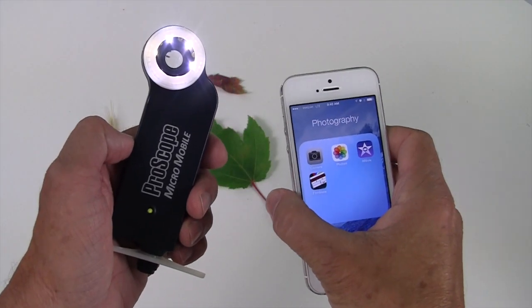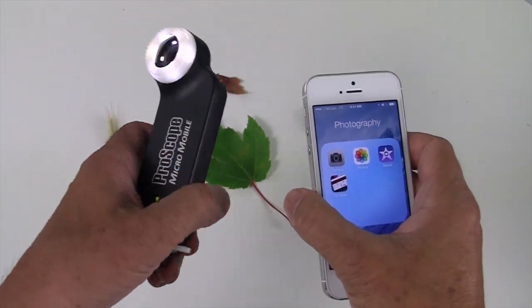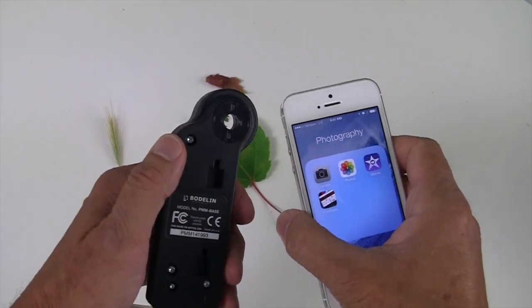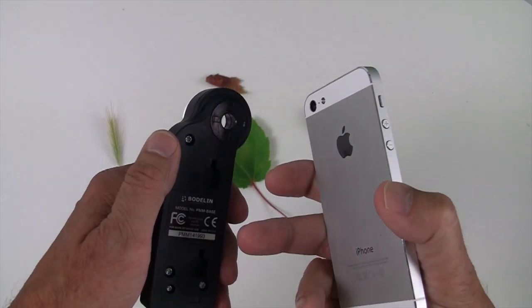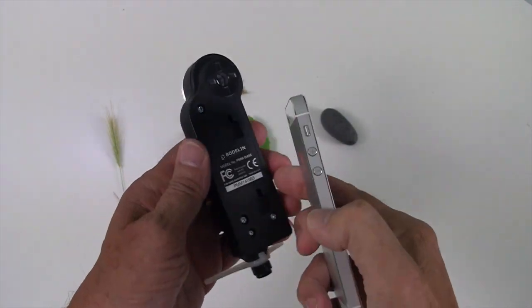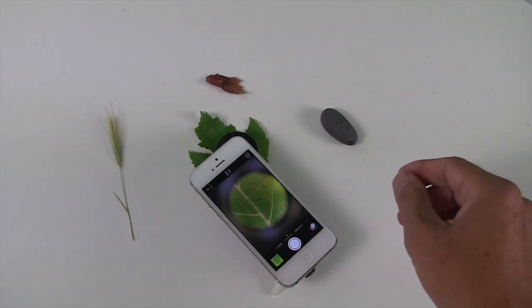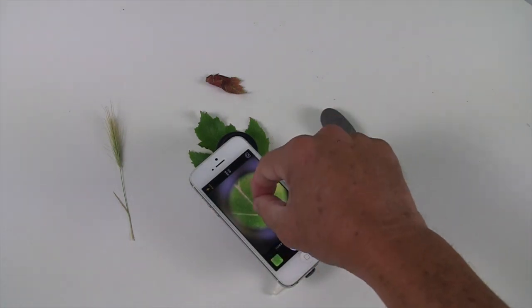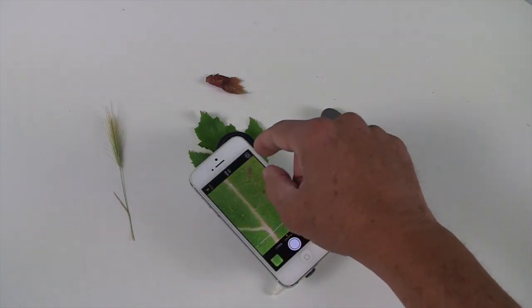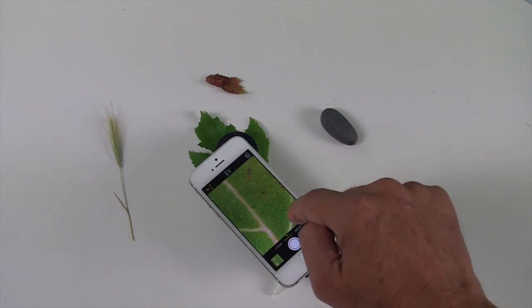If we don't make a sleeve for your mobile device, then all you have to do is just use the ProScope Micromobile base without sleeve and line up our lens with the lens on your mobile device. All I'm doing is using the camera app, lining up the lenses so I see it right in the center. And then I can do the zoom, adjust focus, snap images, and do video.